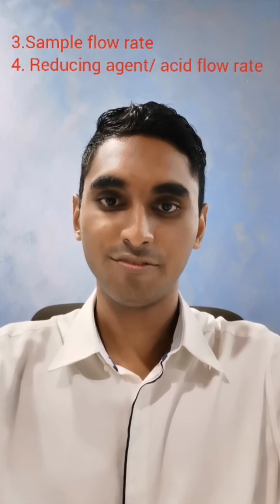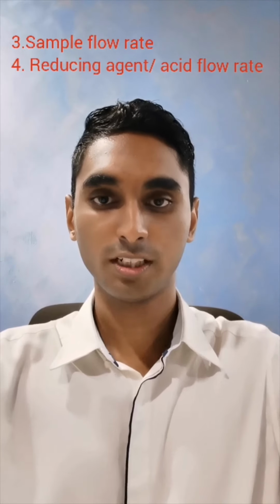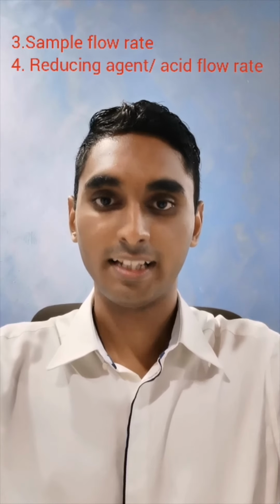The third and fourth parameters optimized in this experiment are the flow rate of the sample and the flow rate of the reducing agent and acid. There are two flow rate adjustments used in this experiment, one for the sample and one for the reducing agent and acid. The flow rate can be regulated by using the knob, which can be tightened and released.